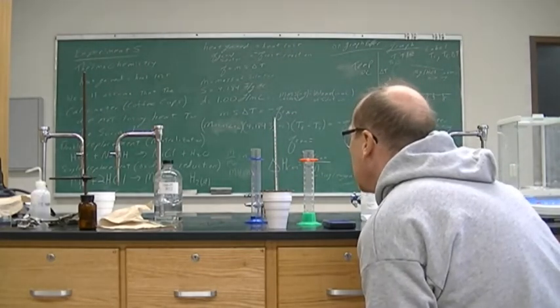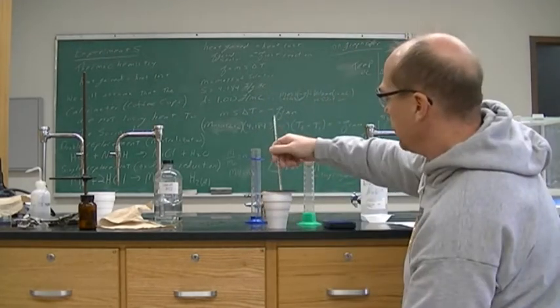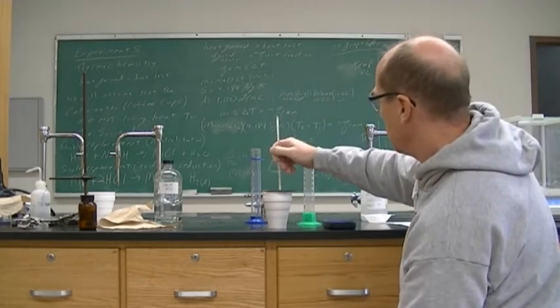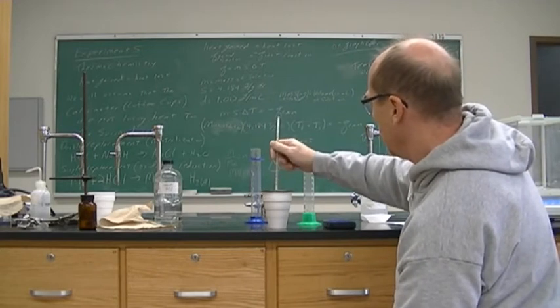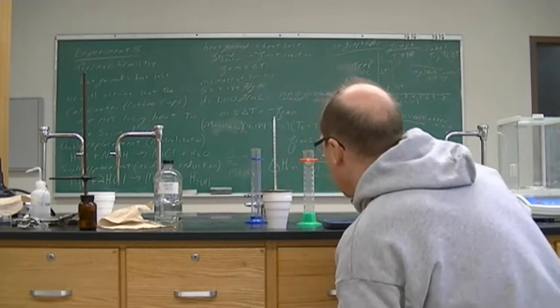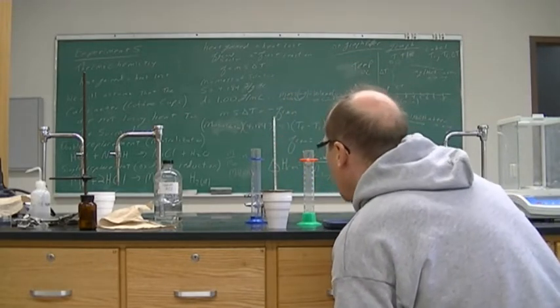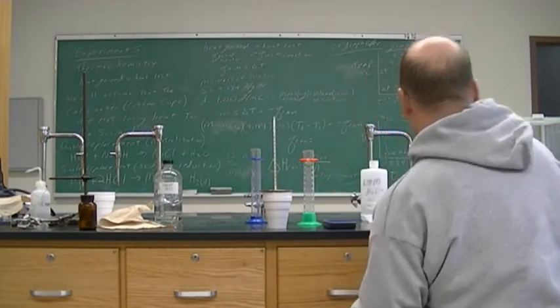We must be getting close to the end of this reaction. Temperature is not going up anymore. Maybe a little. We'll see here. We're moving up to that 7-minute mark. Oh, yeah, slightly up. All right, and so at the 7-minute mark, we are at 34.2 degrees Celsius.